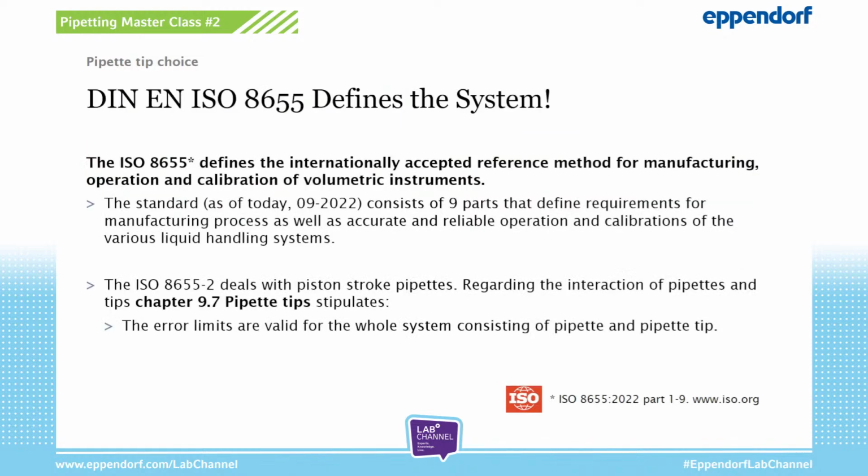So this standard defines the internationally accepted reference methods for manufacturing, operation, and calibration of volumetric instruments. So if you send your pipettes to Eppendorf service for calibration maintenance, for example, the instruments will be calibrated according to this standard, meaning according to the methods and values stated in this ISO. This summer, a revised version was published online by the ISO Council, so calibration labs will change their working standards accordingly. Eppendorf is also working on the adaptation and will adjust its service in the upcoming months.